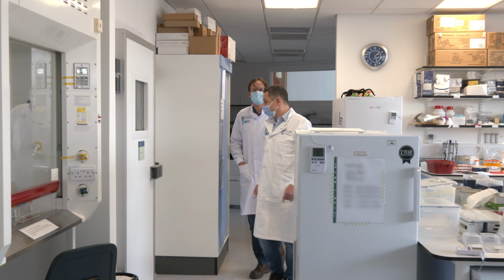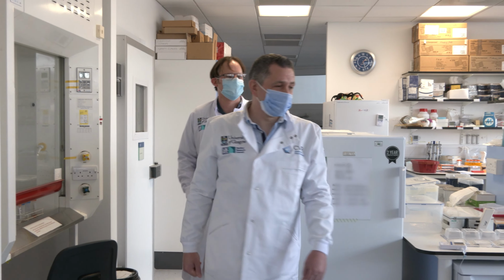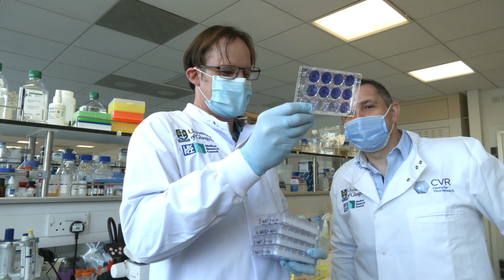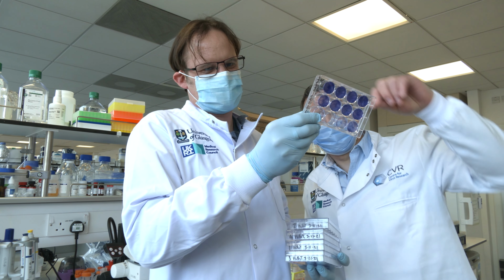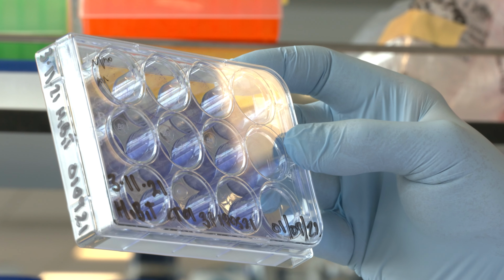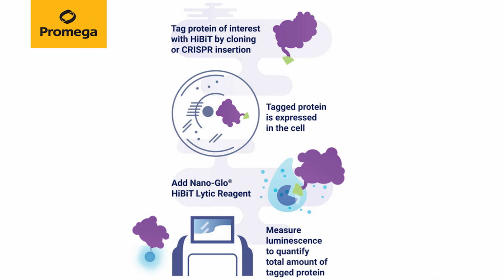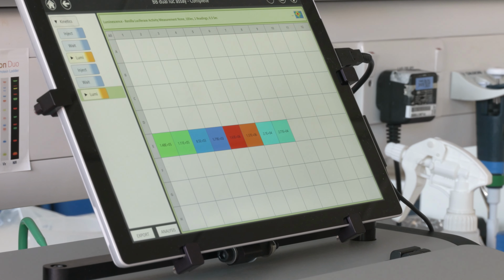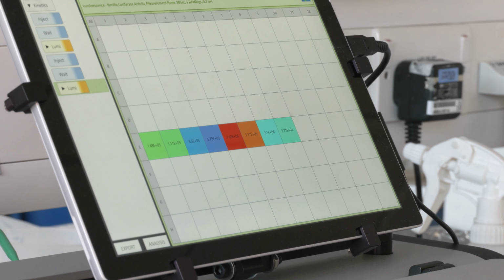There's a protein in our virus which has an unknown function. So I tagged it with HiBiT to see when and where it was expressed during the infection. I have tagged HiBiT on the N, C and middle of the protein I'm interested in and generated a virus which has the HiBiT sequence. I have then infected mammalian and insect cells with the virus, and we then lyse the cells at various time points and measure the luciferase output.